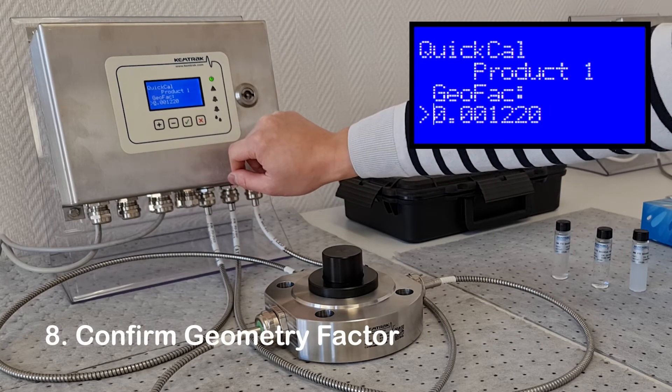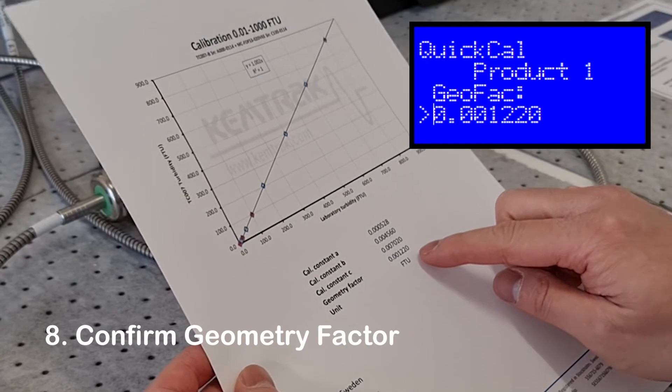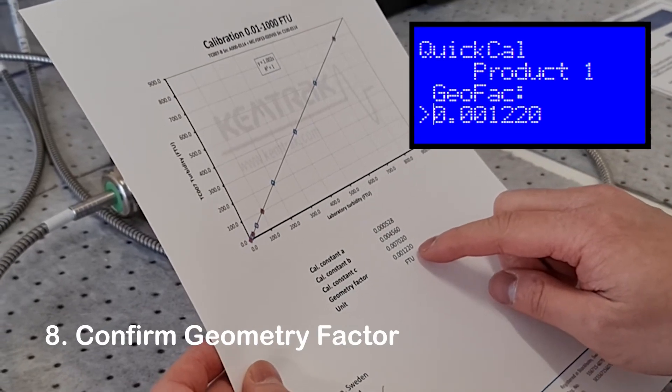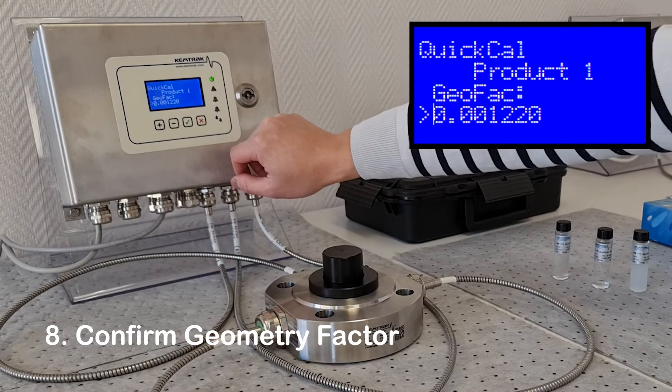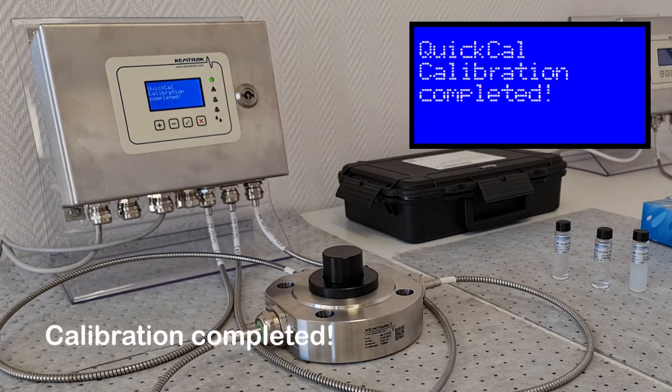The final parameter is the geometry factor, which matches the type and size of measurement cell to the calibration. The calibration certificate supplied with the analyzer can be used to confirm the geometry factor. Now the calibration is completed.